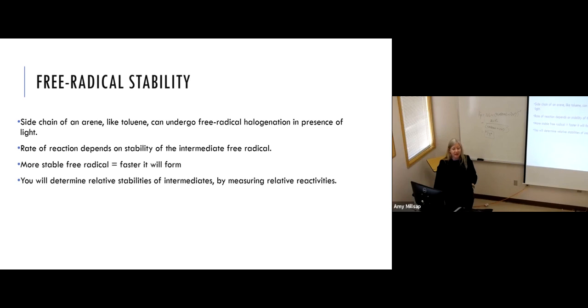Sounds so scary. If the bromine bottle somehow is dropped and it's not dropped inside of the hood, we will all evacuate. Okay? Without delay.